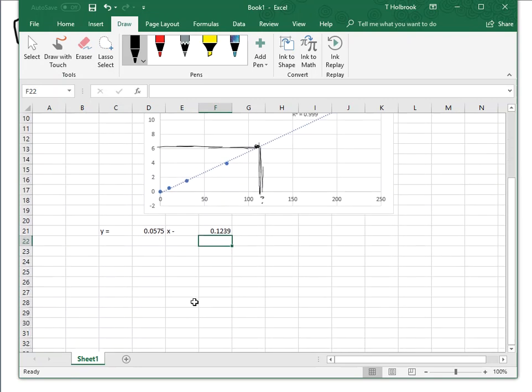So I'm going to scroll down, and we said that our sample number 1, I'm going to put S1 for sample 1, was 0.713. And that's where I'm going to put it here for Y. Y equals right below that, right? So I want to know what is my concentration after I solve for that. Well, over here to the side, I'm going to put bracket X parts per million. And this is where I want my answer to go, right underneath that column. That way, sample 1 is associated with the absorbance. And then in this cell, that's going to be the concentration of the sample.